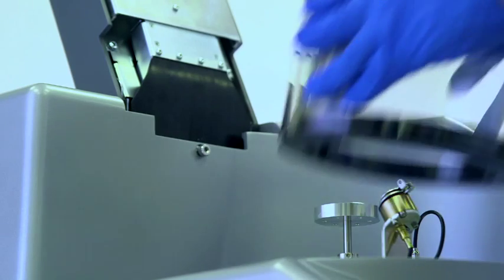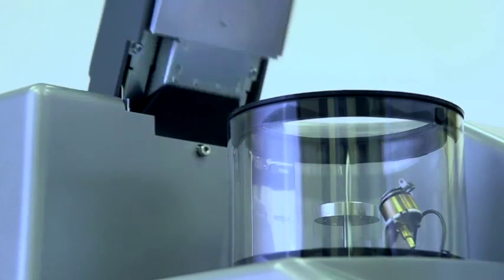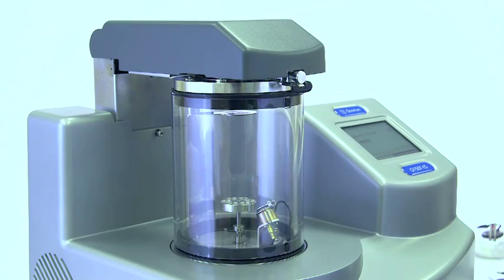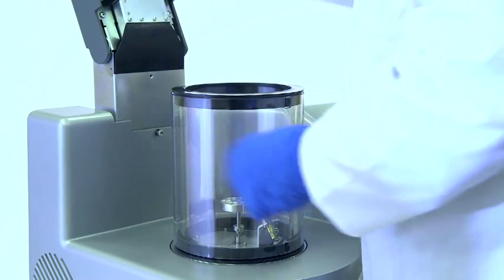All systems are fitted with a 150mm glass vacuum chamber with integral implosion guard. The evaporation systems are also supplied with an extended height glass chamber.